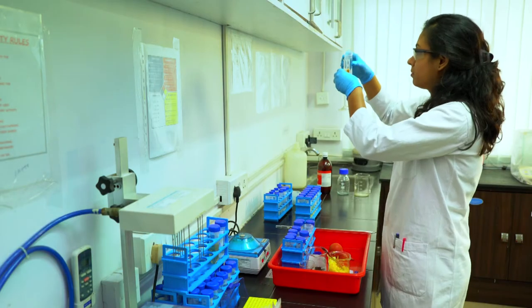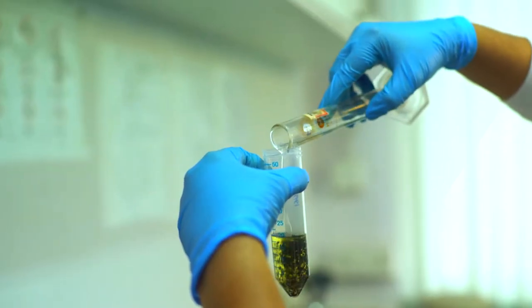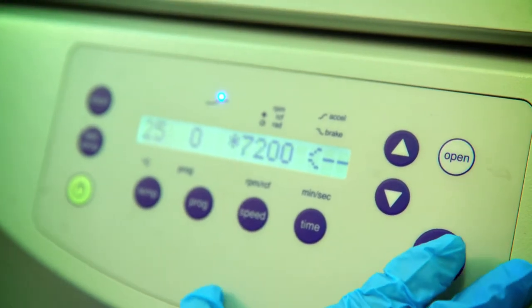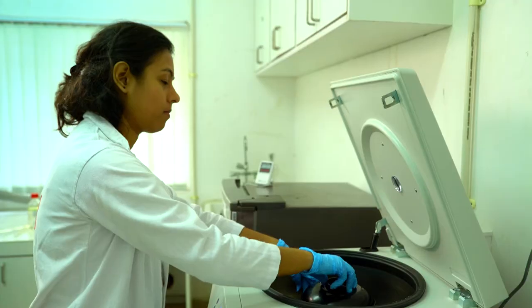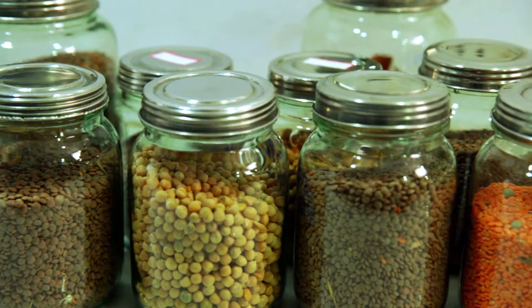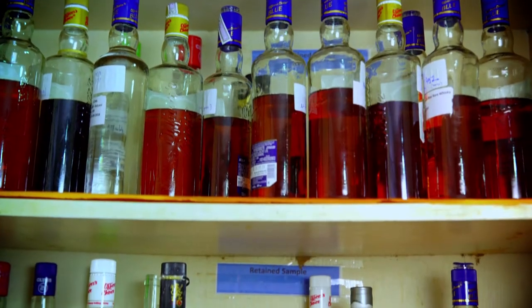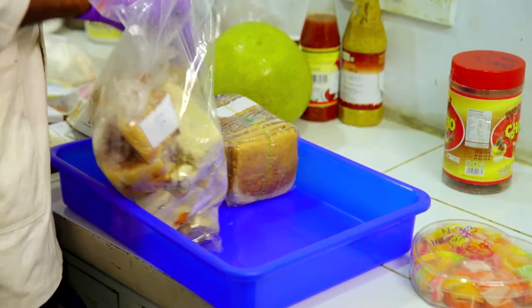At MSK, we are capable of providing solutions at every stage within the food industry. Our expertise and experience delivers services to control quality and safety throughout the food industry, from semi-manufactured to final products.